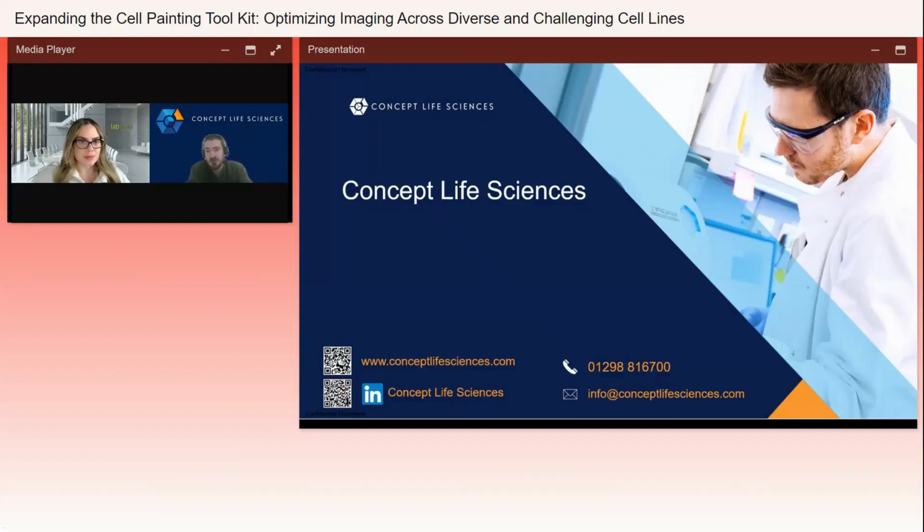The different colors and the relative intensities can be altered on them, but the actual analysis itself is done on the underlying single channel grayscale images, which were also present in certain slides. And they can't be altered. So the masking procedures that are performed on those are where the data output comes from. That'll remain consistent throughout experiments.